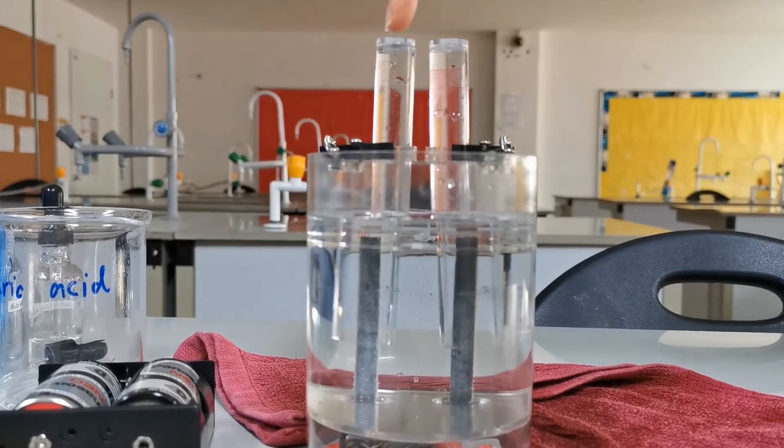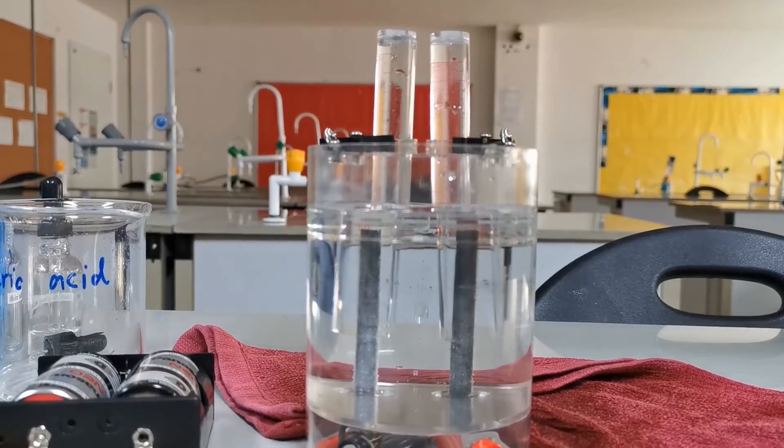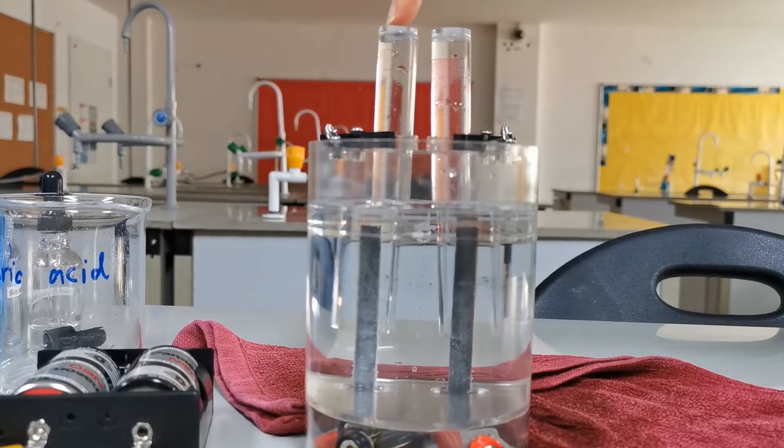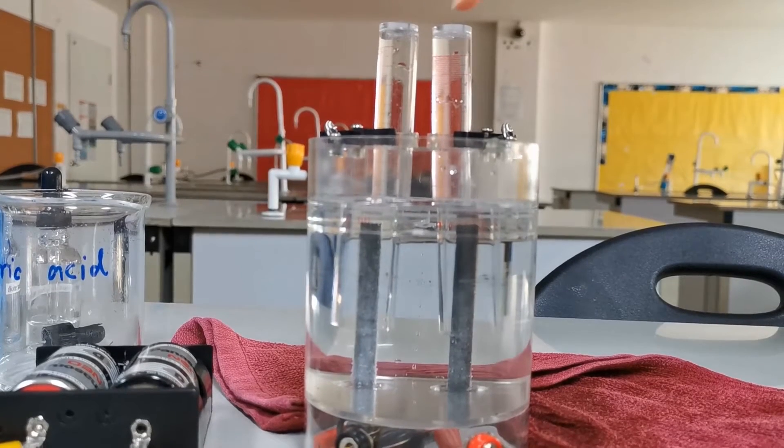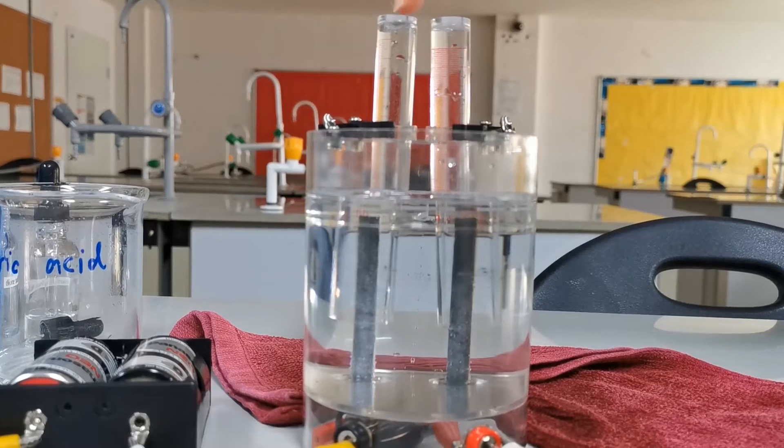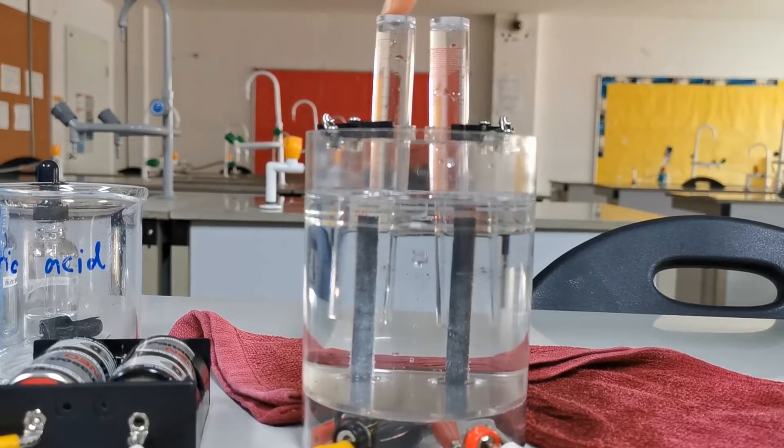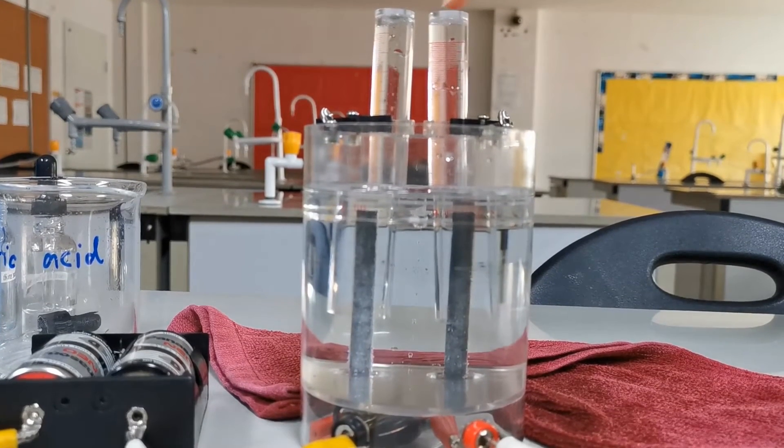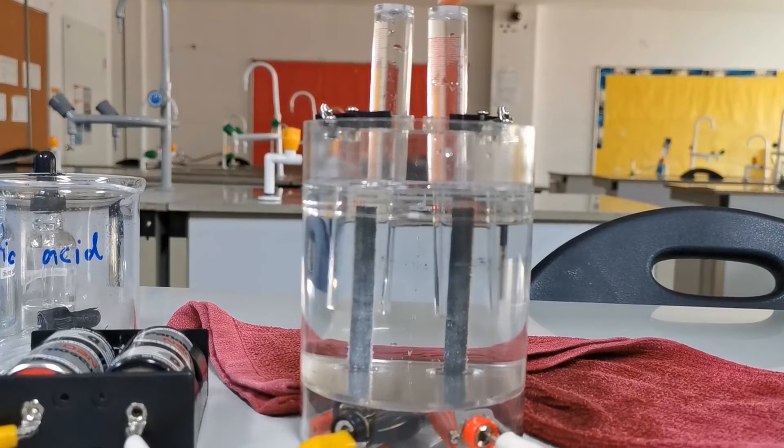This electrode here that's connected to the yellow wire is our cathode. You can see it produces more bubbles than our anode here. Cathode produces hydrogen and anode produces oxygen.